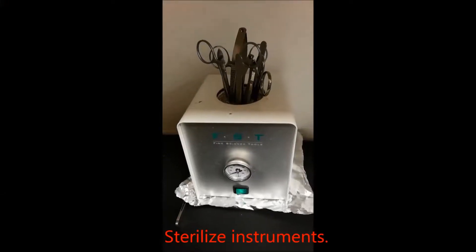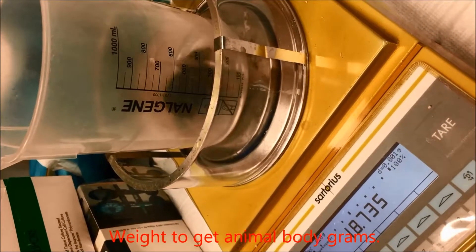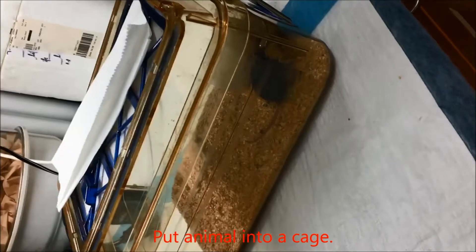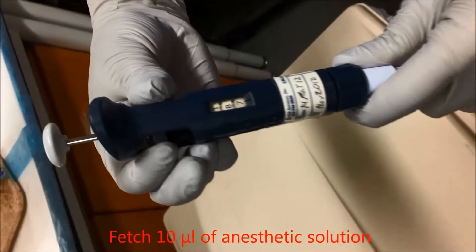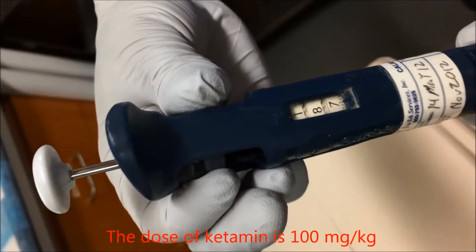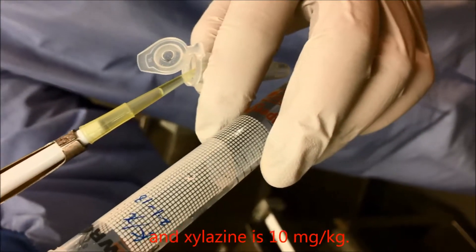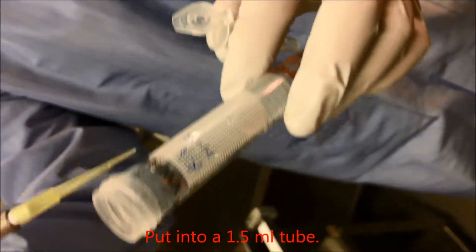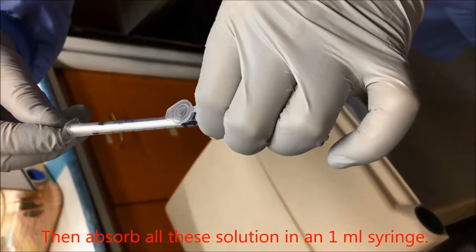Sterilize instruments. Anesthesia: weigh the animal to get body weight in grams. Put the animal into a cage. Fetch 10 microliter of anesthetic solution per gram of animal body weight. The dose of ketamine is 100 milligram per kilogram and xylazine is 10 milligram per kilogram. Put into a 1.5 milliliter tube, then absorb all the solution into a 1 milliliter syringe.